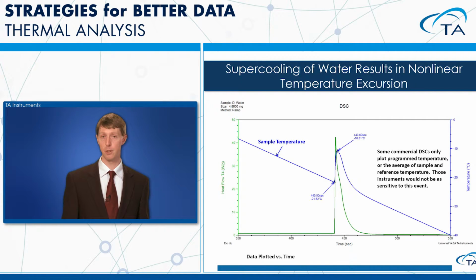If you're trying to develop some kinetic model, some crystallization model of a particular material, and you are just using program temperature, your kinetic data will be wrong because you're not accounting for the fact that that material is actually changing temperature as it goes through that reaction.